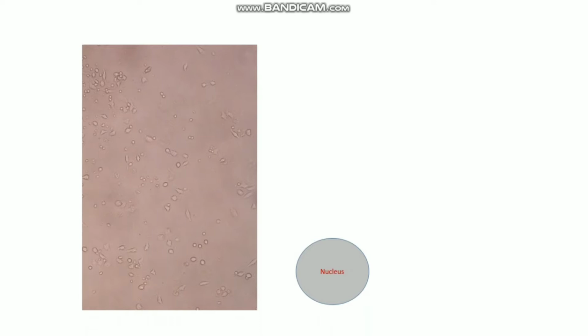To perform the transfection, there are some important points you have to keep in mind. You have to check the cell viability. It should be high, around 90% viability, which will be better. And when you subculture the cells for transfection, just before transfection, the cell confluency should be not more than 50%, and the cells should be single cells and uniformly distributed in the dish. So you have to keep that point in mind, and then your transfection efficiency will be high.